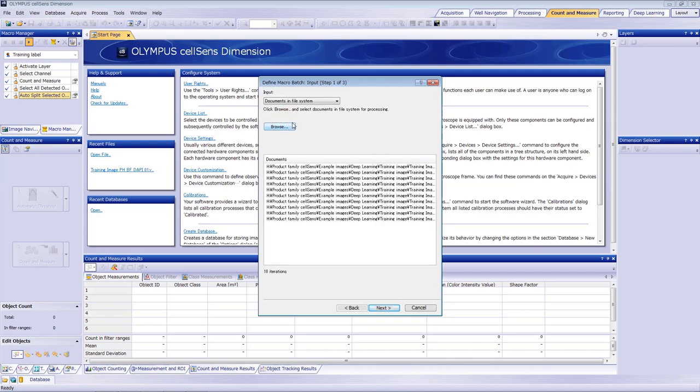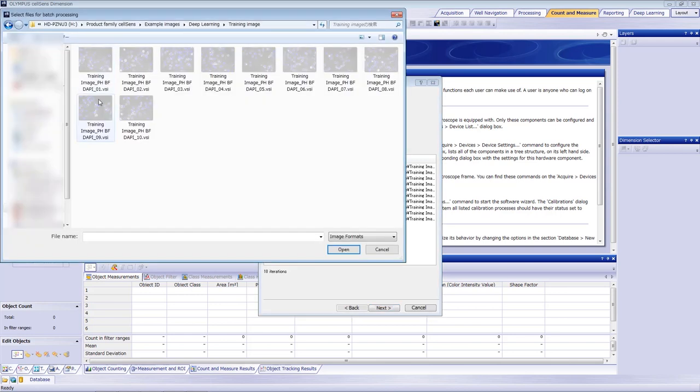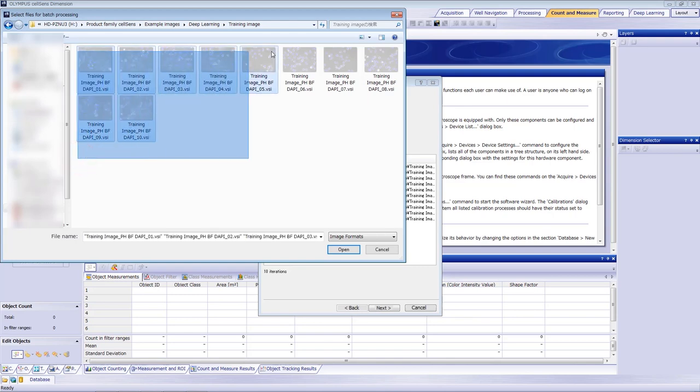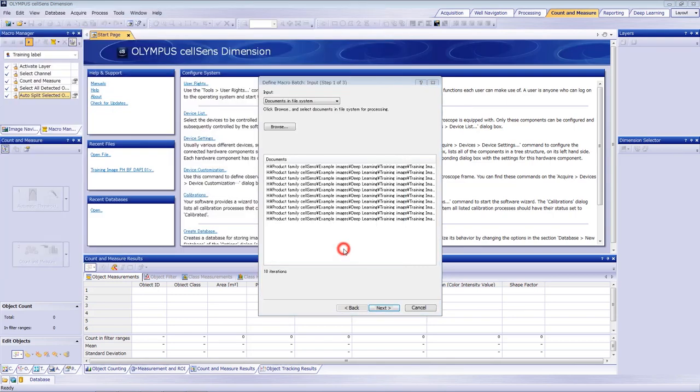To define these input images, select Documents and File System and select the 10 training images. Then click Next.